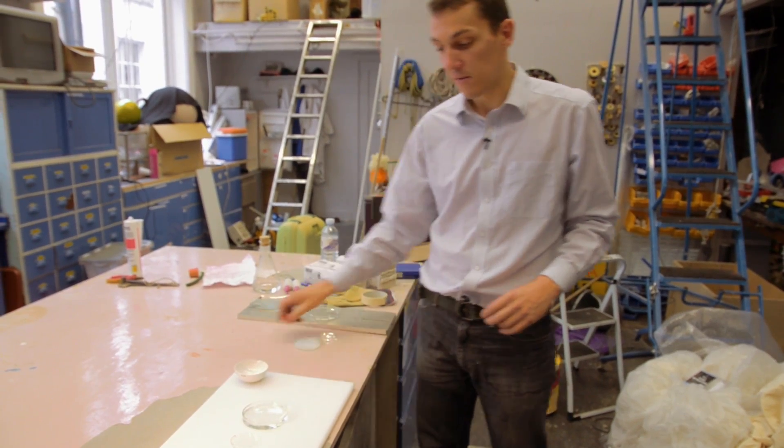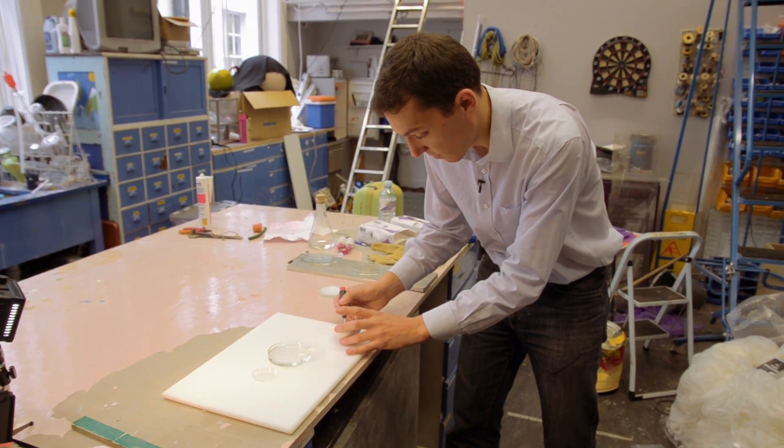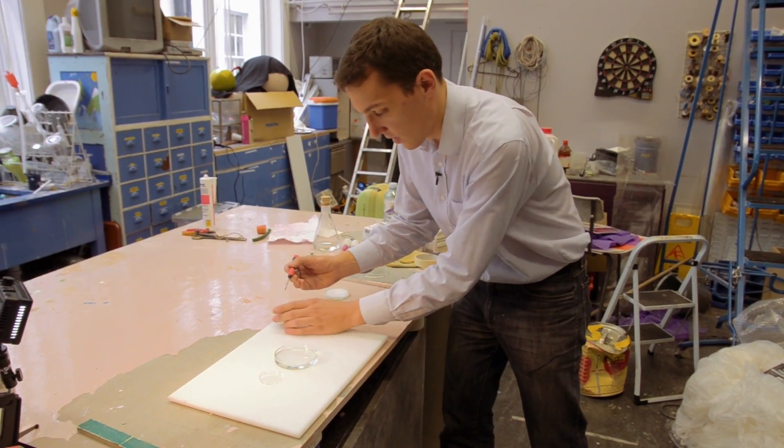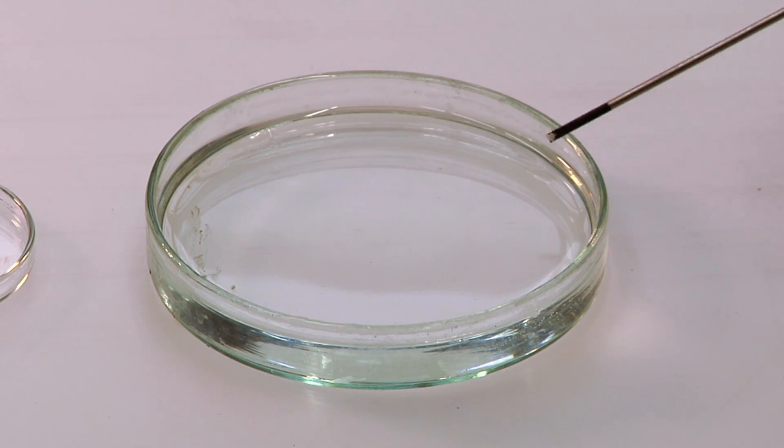This is a supersaturated solution — there's more sodium acetate salt dissolved in the water than can stably remain there. Although it appears stable, given a bit of a kick it will suddenly revert to its alternative state as a solid, as a hydrated crystal. I've got some salt crystals here which I'm just going to pick up on this screwdriver and drop into the corner — this is the kick it needs to turn it from liquid into solid before our very eyes.